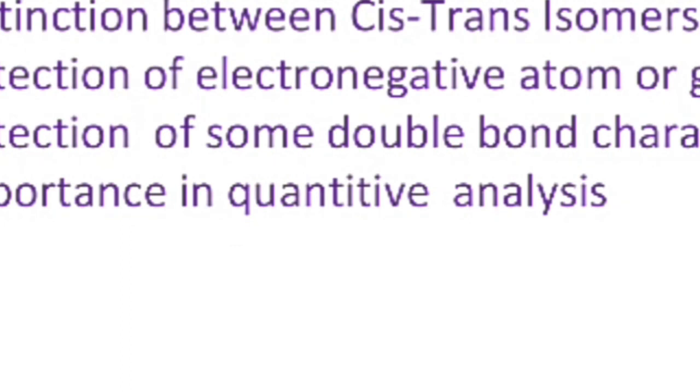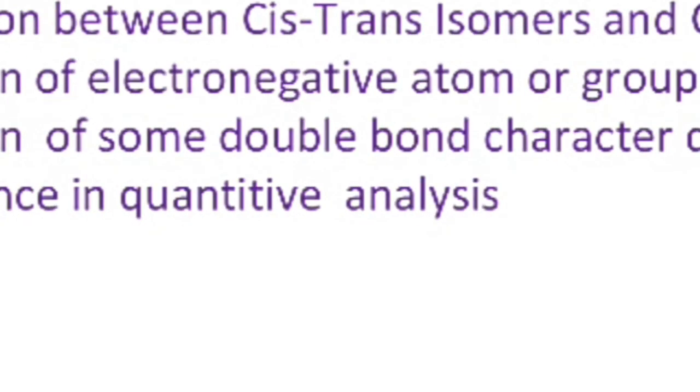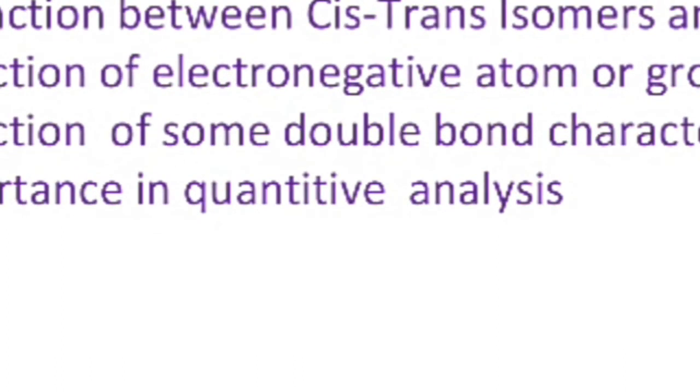Detection of electronegative atoms or groups: we can use NMR spectroscopy to detect electronegative atoms or groups in a compound.